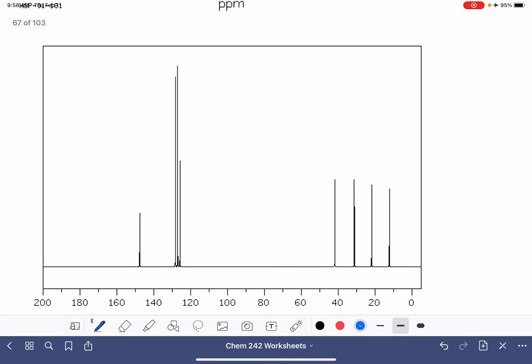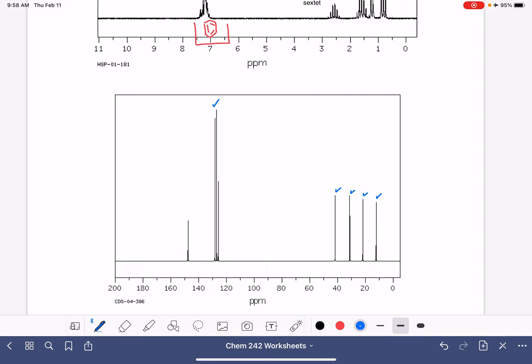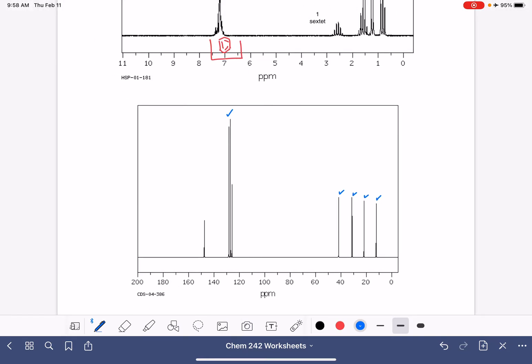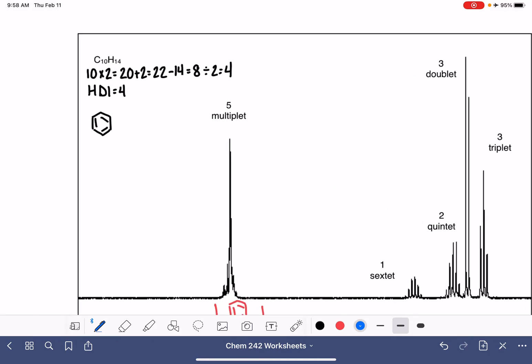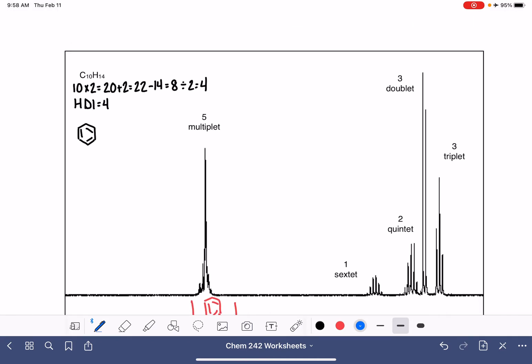Let's take a look at our carbon NMR, because remember we don't get a lot of information from carbon NMR — mostly we just get the number of different types of carbon atoms. Counting the peaks: one, two, three, four, and then all of our benzene carbons right there. So we've got four types of carbons plus the carbon atoms that are in the benzene ring.